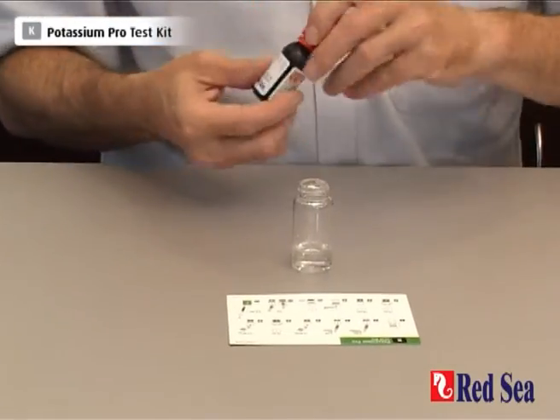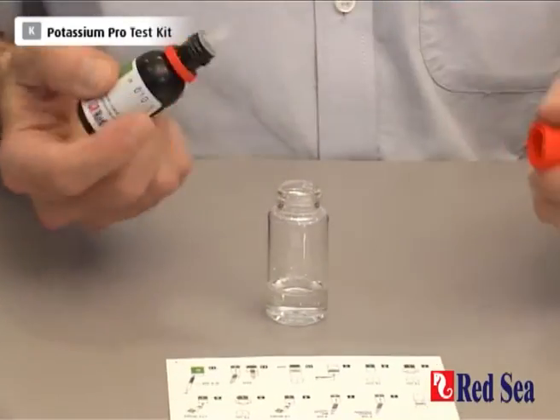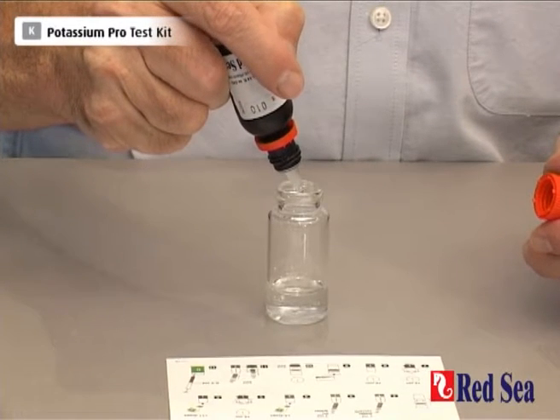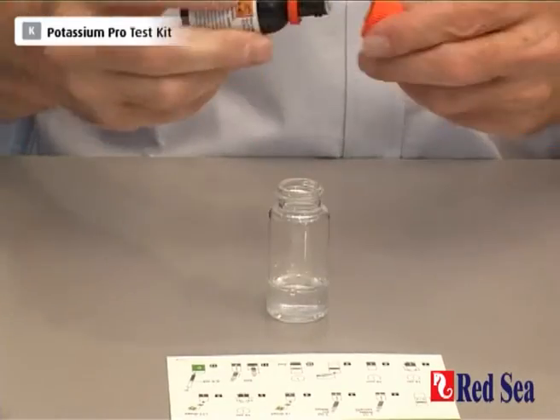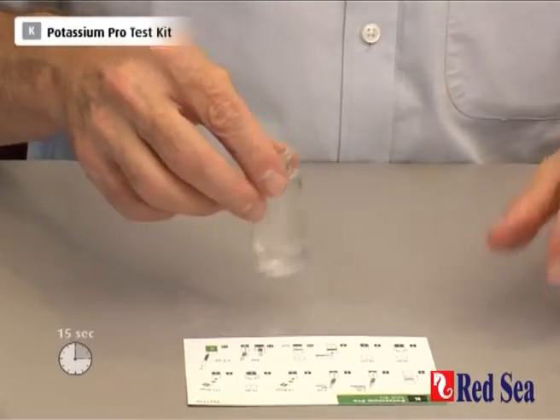We now start by adding 4 drops of reagent A: 1, 2, 3, 4. And shake for 15 seconds.